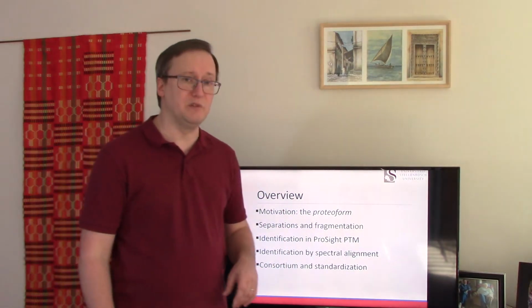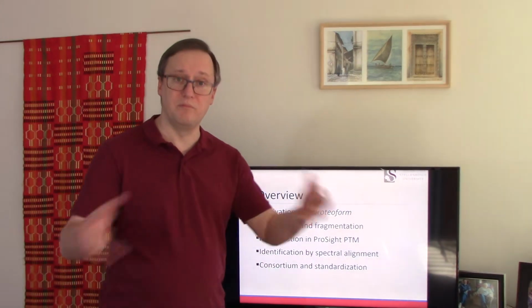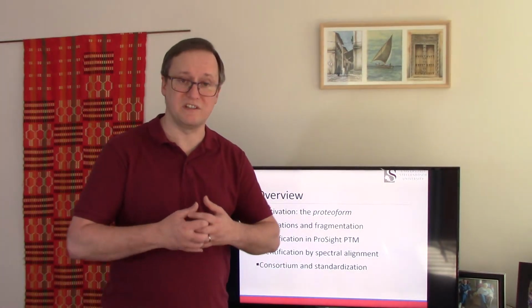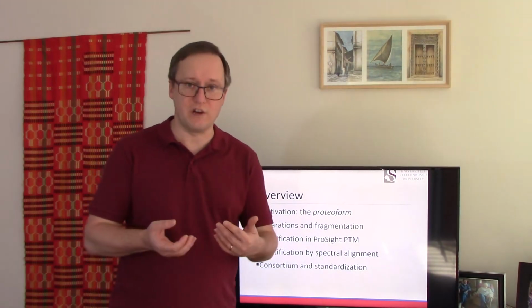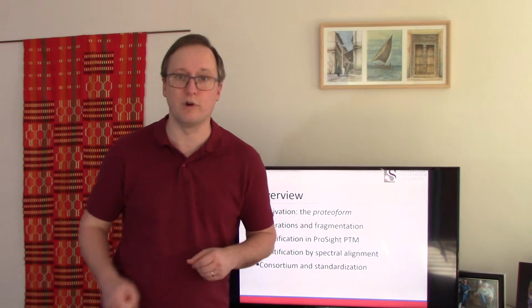And finally, we'll talk a little bit about a consortium that's formed to help construct top-down proteomics as a field, as a technology, and talk about some of their efforts towards standardizing the way that we talk about proteoforms.